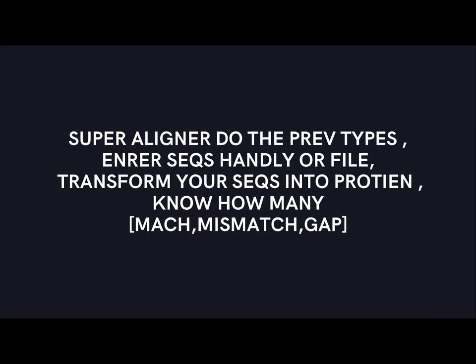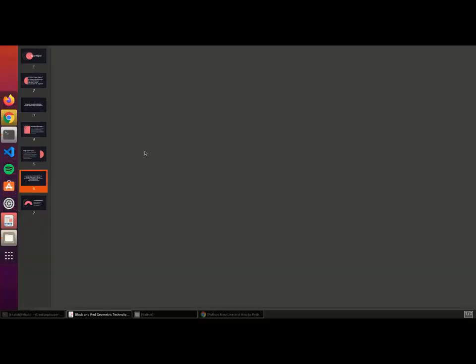By using more than one algorithm, we built a tool that combines the pairwise and multiple alignment algorithms in one place to make the alignment easier. And that's how our aligner tool came to life. So let's test it out.